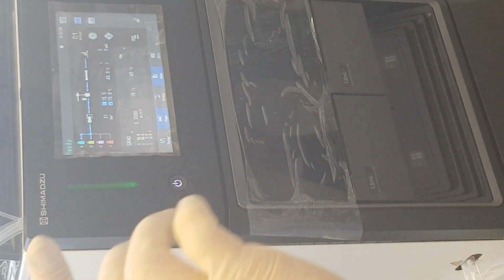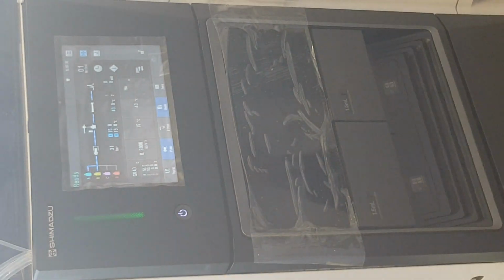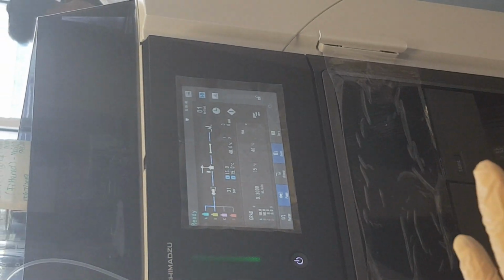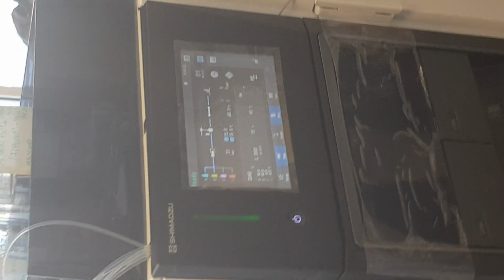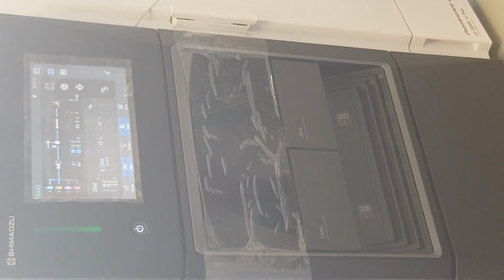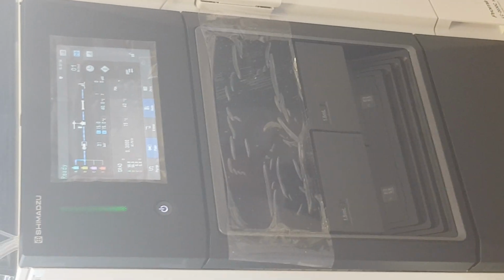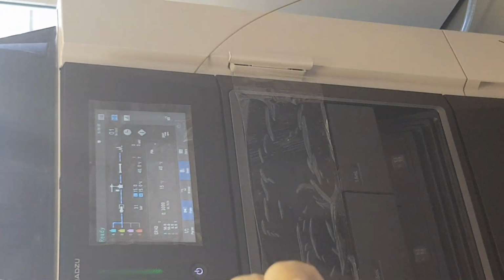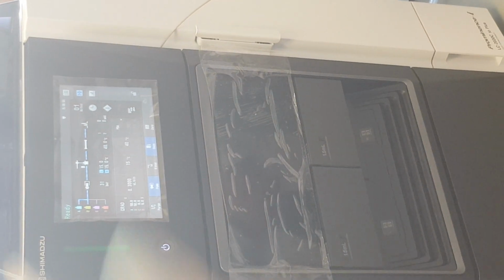Meaning, the system requires some time for solvent B to push out all the solvent A in order to allow the analytes to interact with the stationary phase at its optimum condition. Do you understand what I'm talking about? So you need to ensure that your solvent B is filled up entirely inside the column. Okay, you need to push out whatever is there before your analysis.